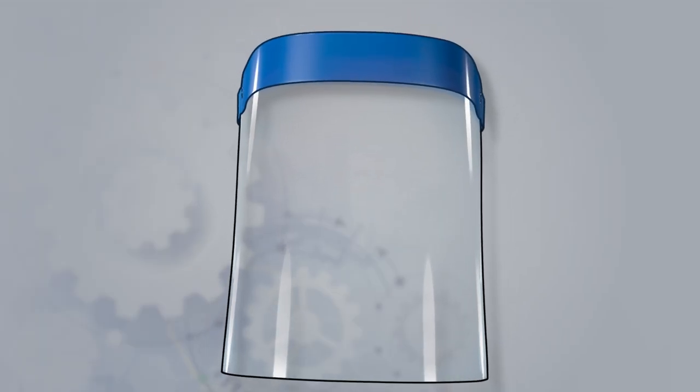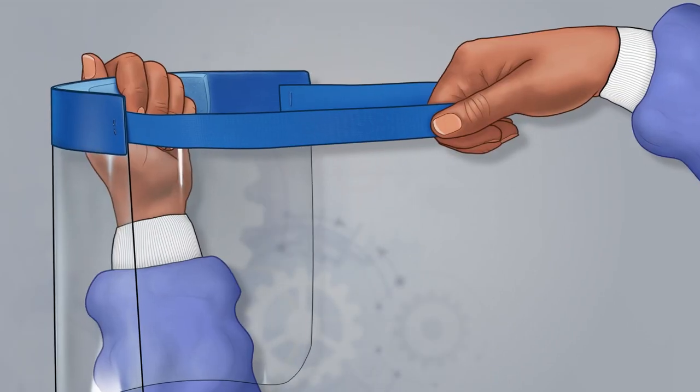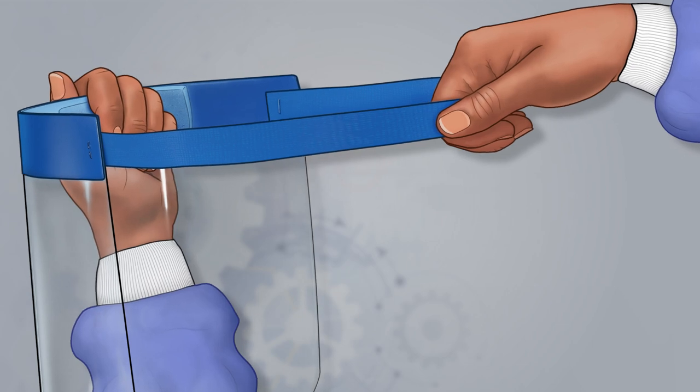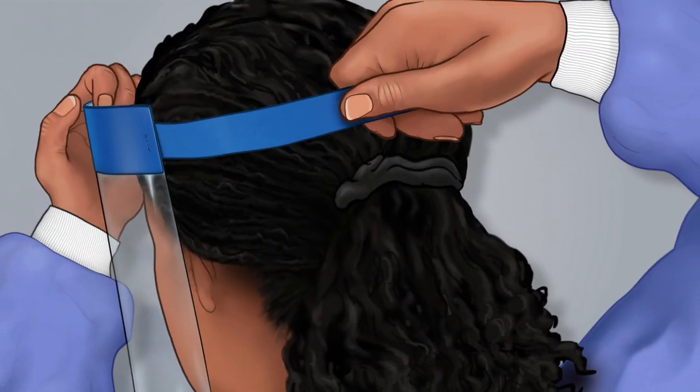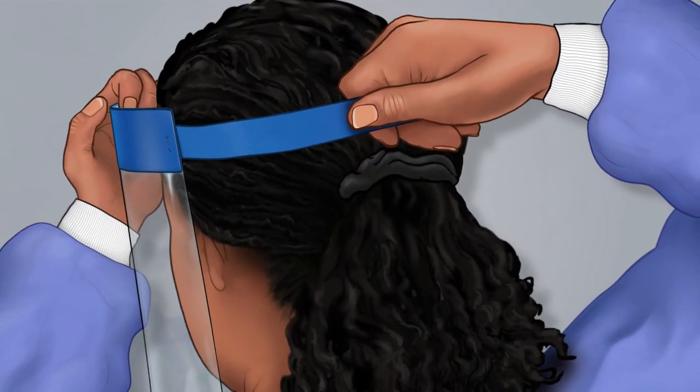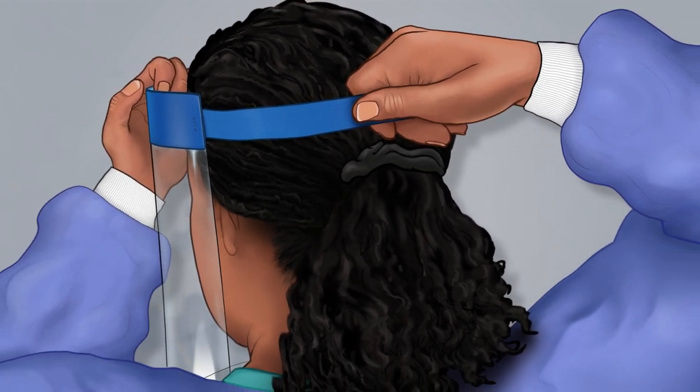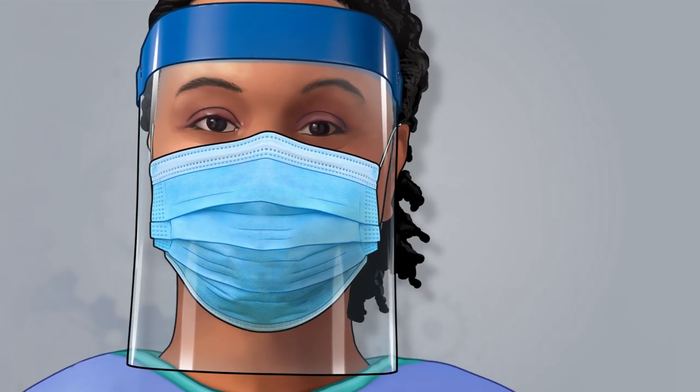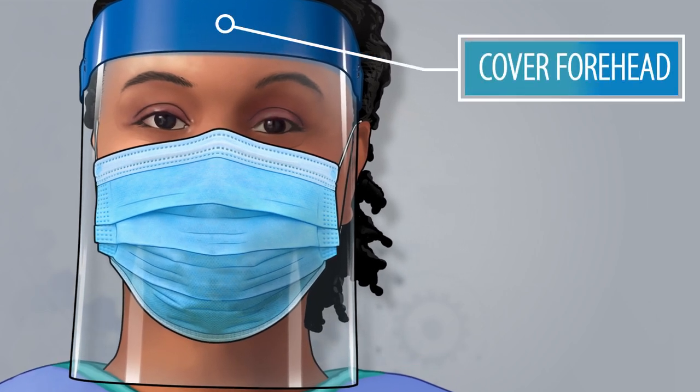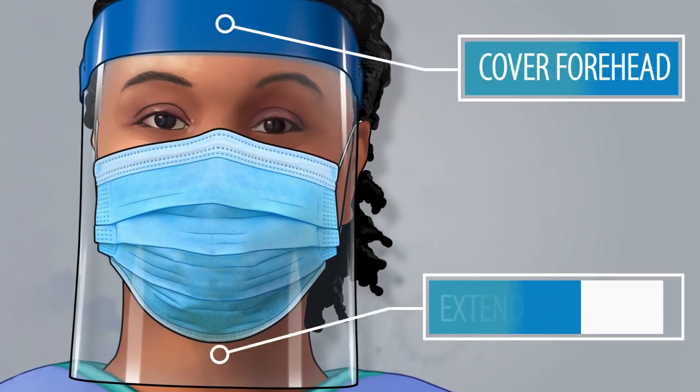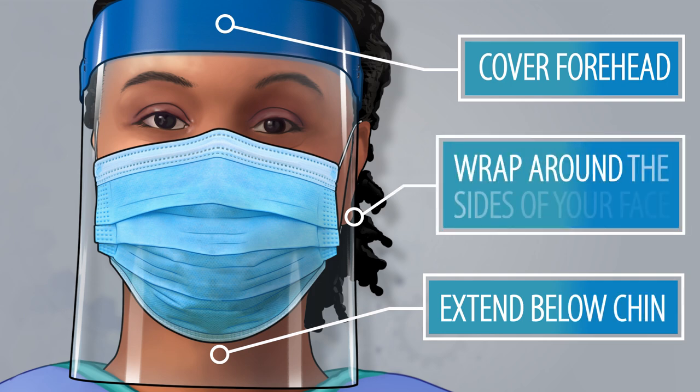Put on the disposable face shield and stretch to expand the elastic strap and place it behind your head with the foam resting just above your eyebrows. Use the strap so that it fits snugly against your face. Face shields must cover your forehead, extend below your chin, and wrap around the sides of your face.